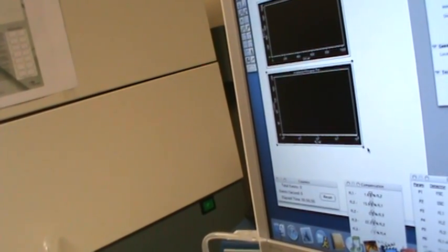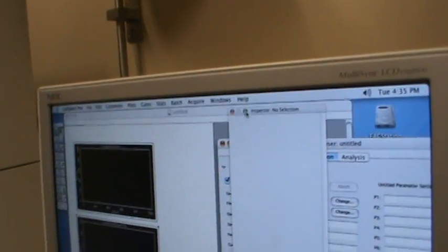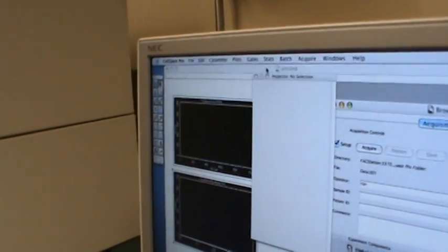Okay. Now, we're going to click on this. This inspector you can pull down. So I think you can pull it down. I'm not good with Macs, but is it here? Nope. We're going to move the inspector. But we're going to bring back this channel.